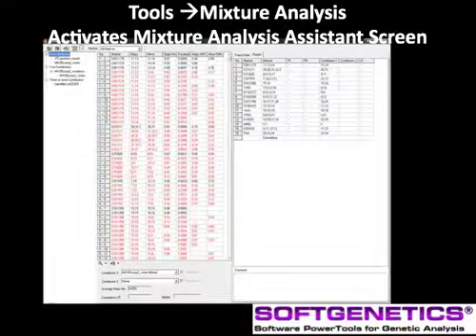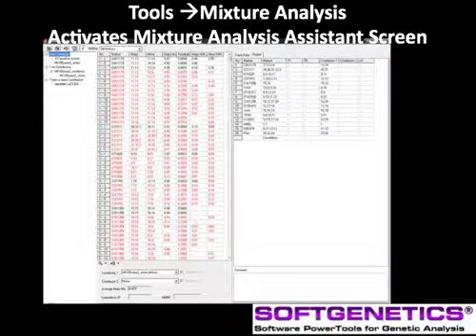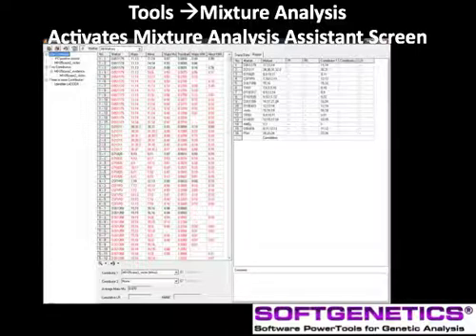After review and confirmation of the allele calls, activate the mixture analysis screen from the application dropdown and select Mixture Analysis. In the upper left side of the screen, we see the files grouped in a file name tree, dependent on whether they have the characteristics of a single contributor, two contributor, or three or more contributors.